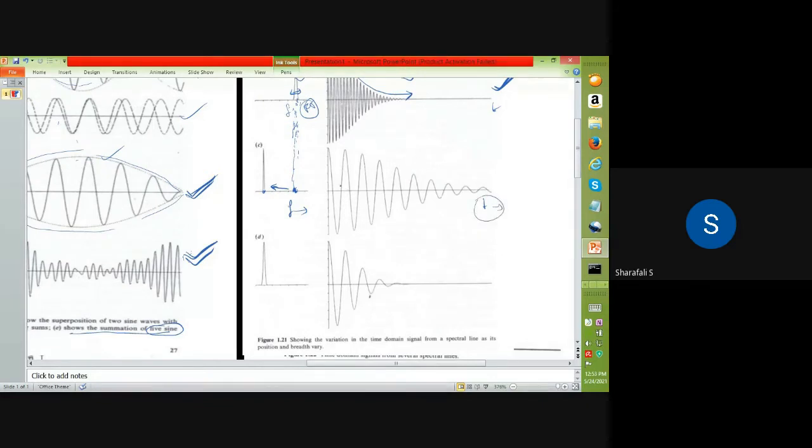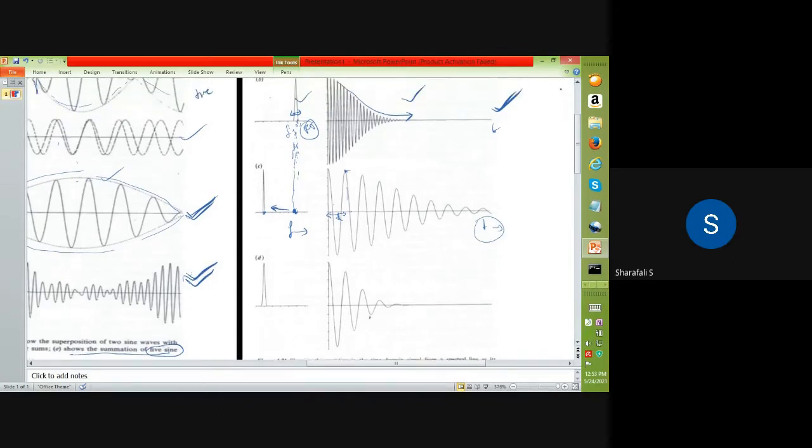you can see, when you consider this particular signal, this one, in one complete cycle, measure the time for this complete cycle and take the inverse of that, you will see that the frequency has been changed in this particular case.